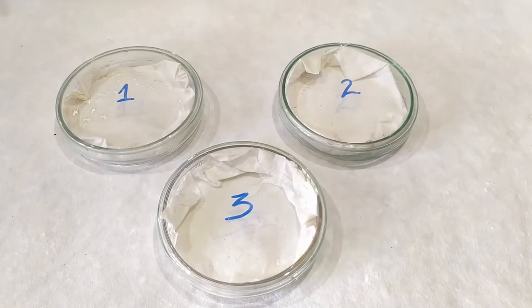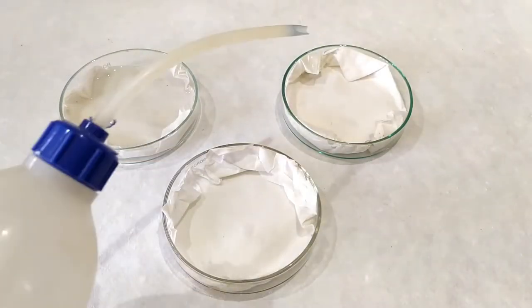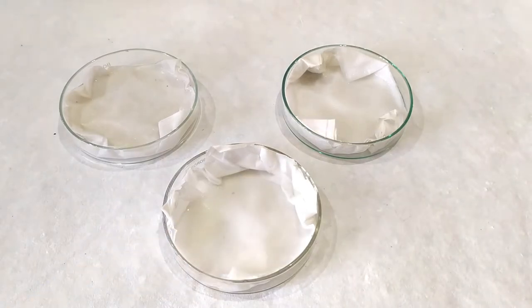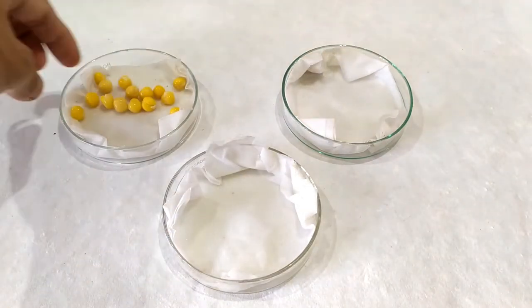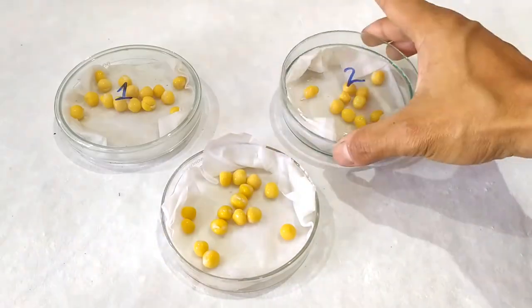To begin the experiment, take the three Petri plates and label them 1, 2, and 3. Place a layer of filter papers or cotton pads in the three plates and wet them with water. Remember, place equal amounts of pre-soaked seeds in all three plates.